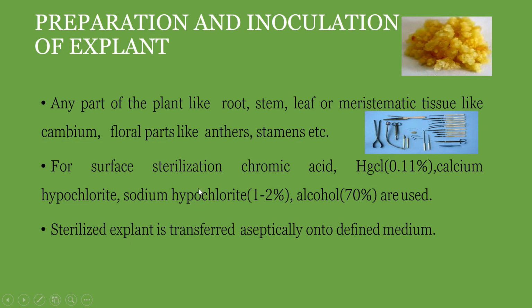The treatment with these chemical agents should be very short, around 1 or 2 minutes. Once the explants are sterilized, they are transferred aseptically onto the defined media.